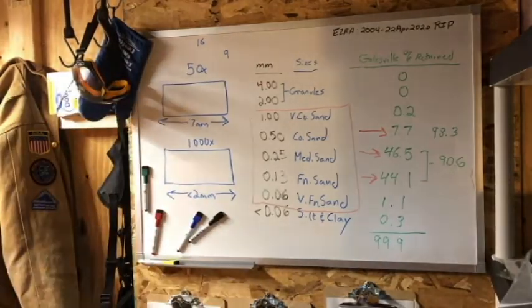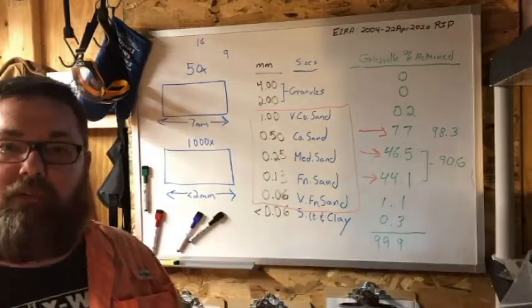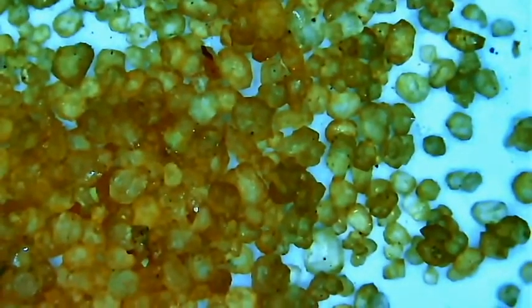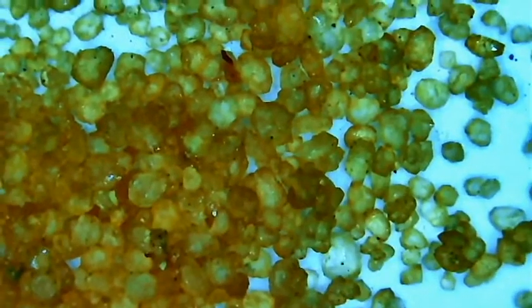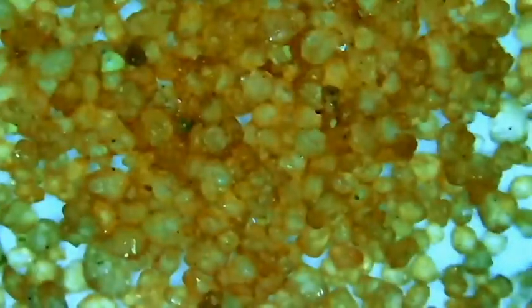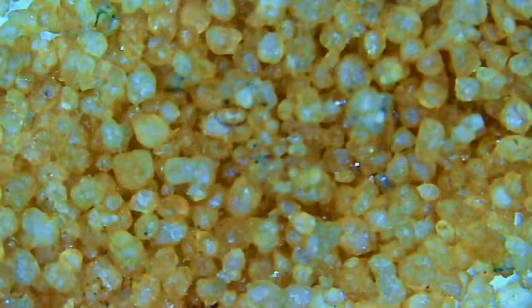We zoom in. We're going to start at our 50x, our seven millimeter width. And we zoom in. What we start to see here is the grains still look kind of orange-ish. That is due to iron, but it is actually surficial. These grains are transparent to translucent, not opaque at all. It's a very clean quartz sandstone.